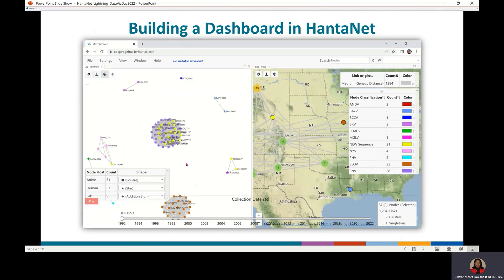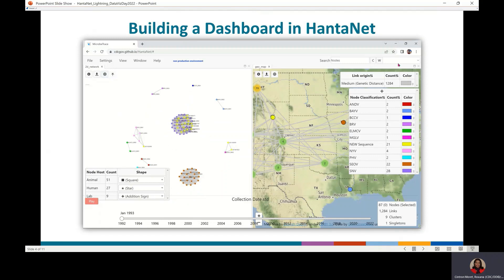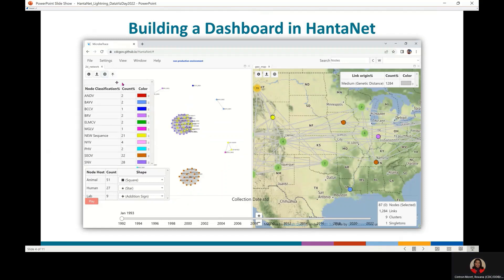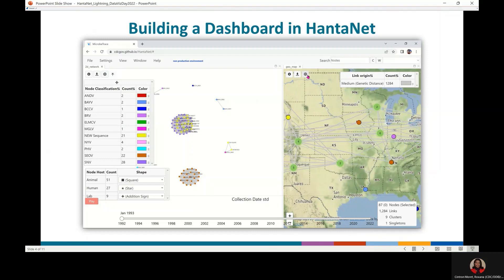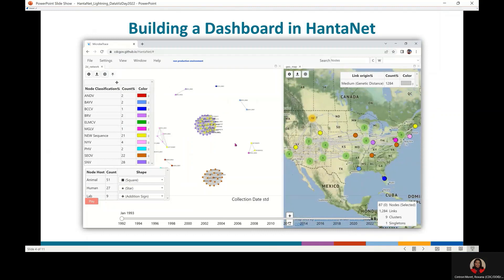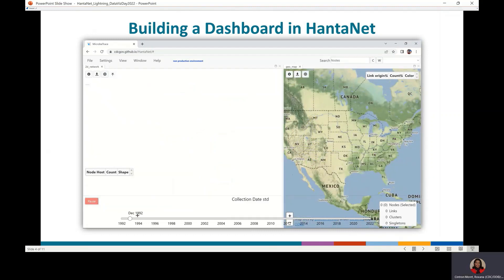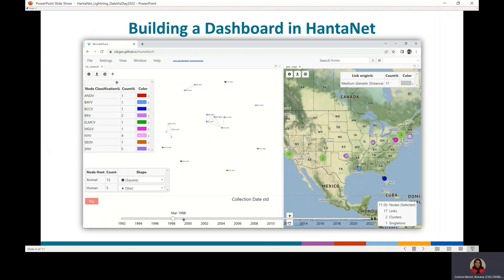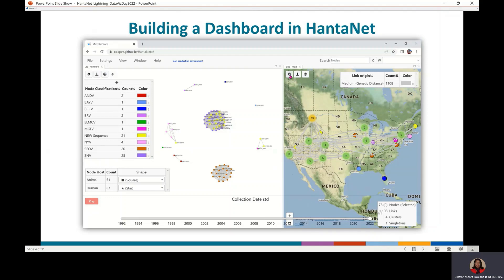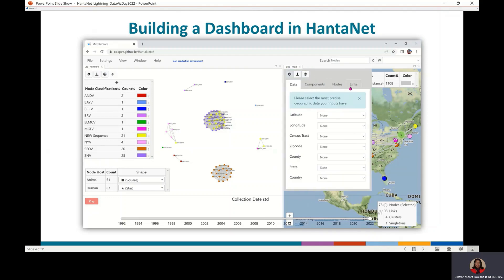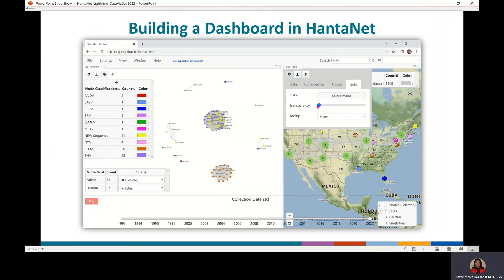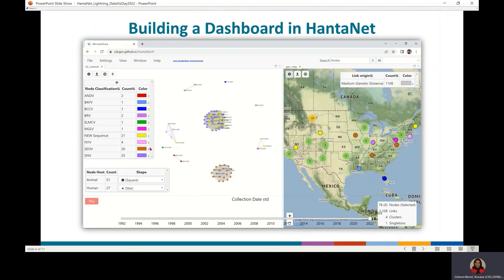Drag the network tile next to the map tile to build the dashboard view. Move the tables and views to the desired positions. Now play the timeline and see the appearance of nodes and clusters by collection date and geographic location. The map view can be customized to add tooltips and adjust the transparency of the links.